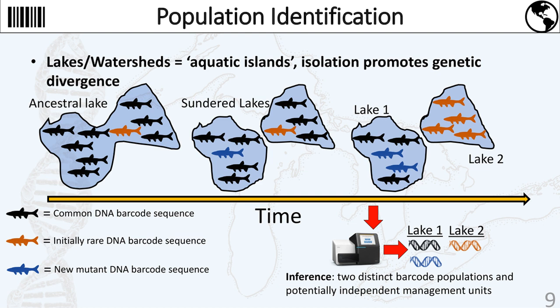Metabarcoding can identify individual barcode variations inherent within species and whether these segregate by putative population or by geographical feature, for example, a watershed or lake. Whilst it is possible theoretically to target individual genetically diagnostic and distinct populations with targeted approaches, metabarcoding of intraspecific variation will provide a much larger and more geographically informative screen of threatened taxa and thus reveal to clients the designation status of their local population or populations of target organisms.